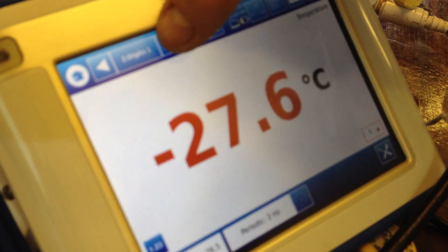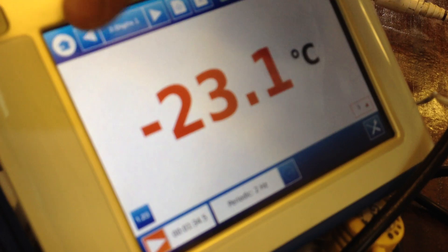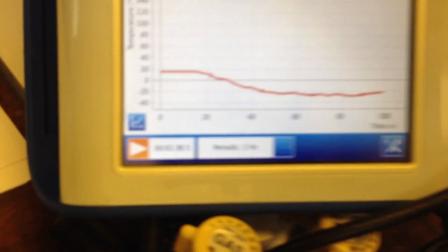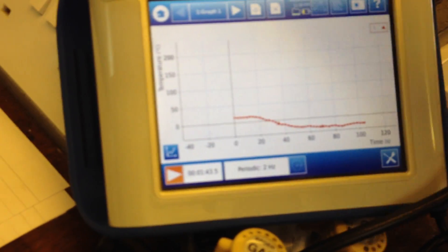I'll just change it to graph so you can see that it's plotted. You can see the temperature change, which actually is quite rapid at the beginning.